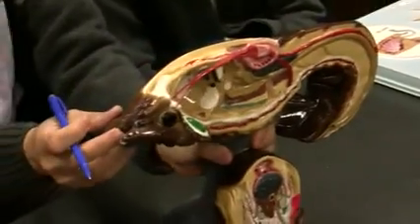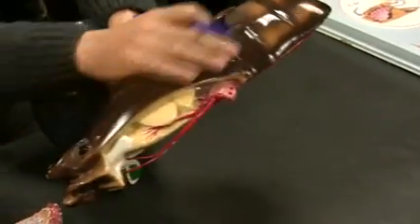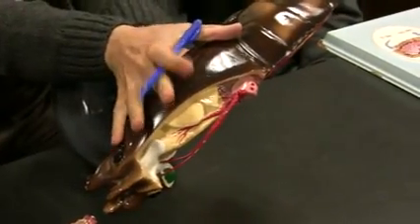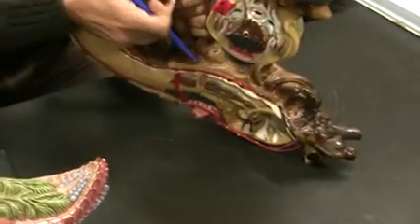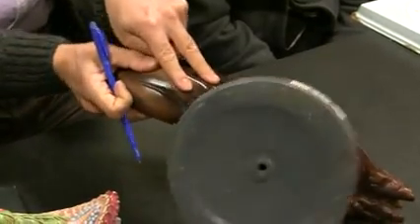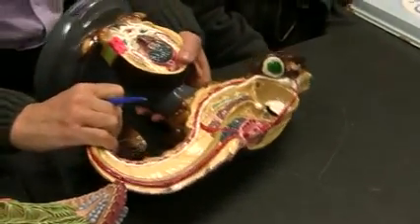Again, rostrum here. Let's do some external anatomy. Compound eye, rostrum, carapace. Is that right? Cephalothorax, abdomen, right? And then uropod, telson, right here. They cut the animal in half. So I have two uropods here and a telson right there. So that was the external anatomy.